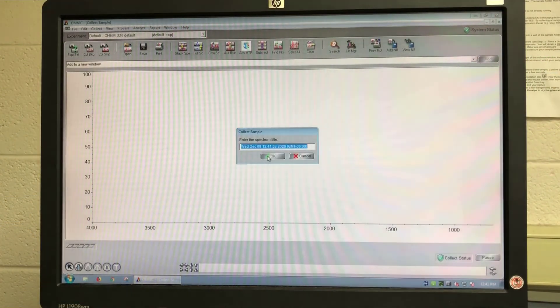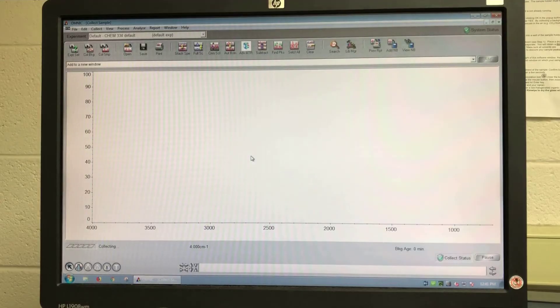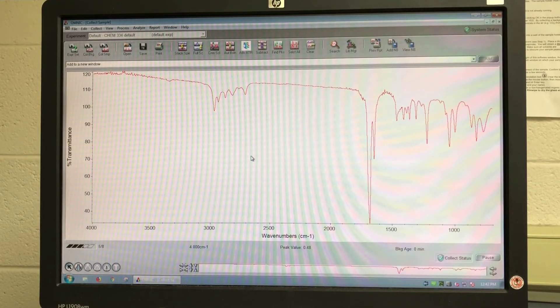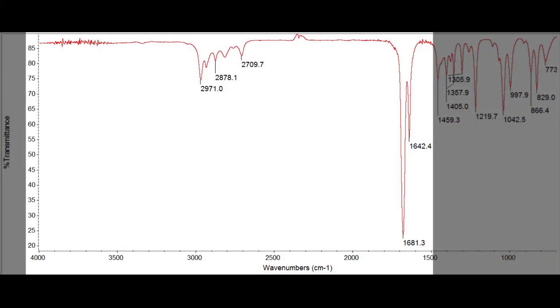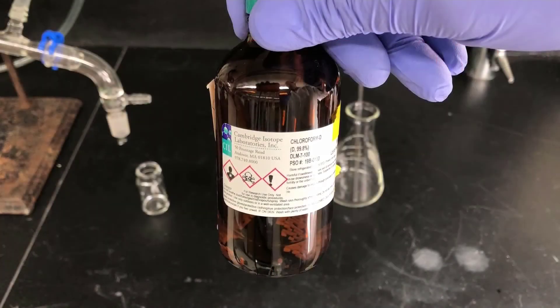Operation of the IR spectrometer software — the OMNIC program — has been described in previous videos. I'm just going to show the collection here and you can refer to one of those prior videos for processing and other details. Here's a high resolution IR spectrum of the product. You should identify all of the peaks in the functional group region.